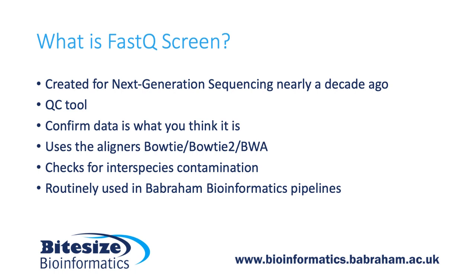FastQ Screen allowed you to quickly assess the quality of your data. Specifically, this tool was designed so that the user could quickly confirm that the reads in their sequencing run were derived from the organism that they would expect. This might sound at first glance a trivial question to address and not necessary, but actually there are lots of reasons why maybe the reads in your sequencing run are not what you expect.